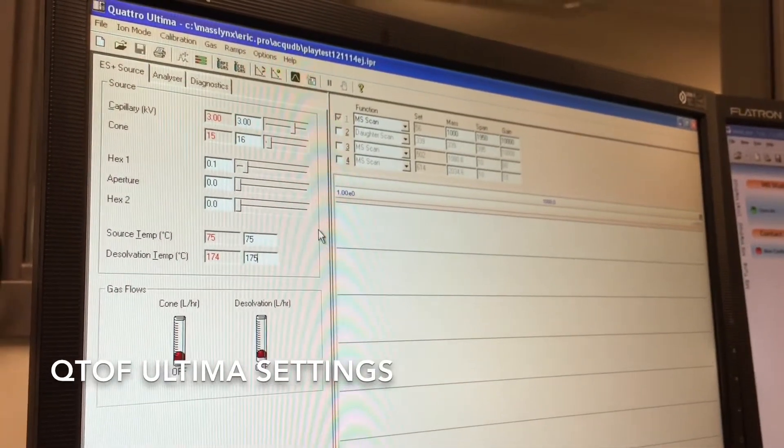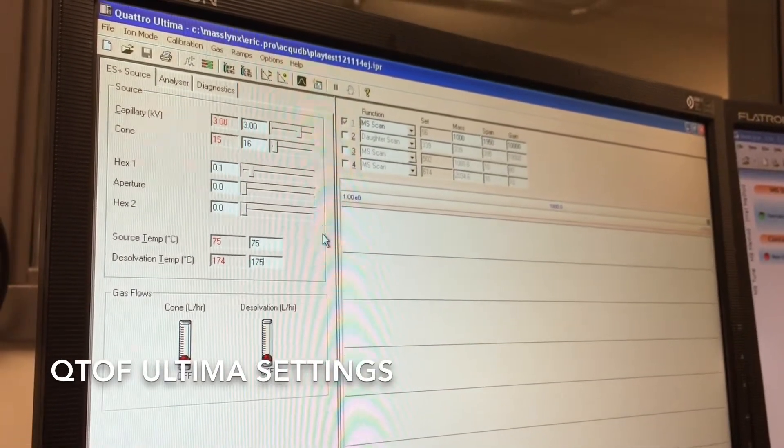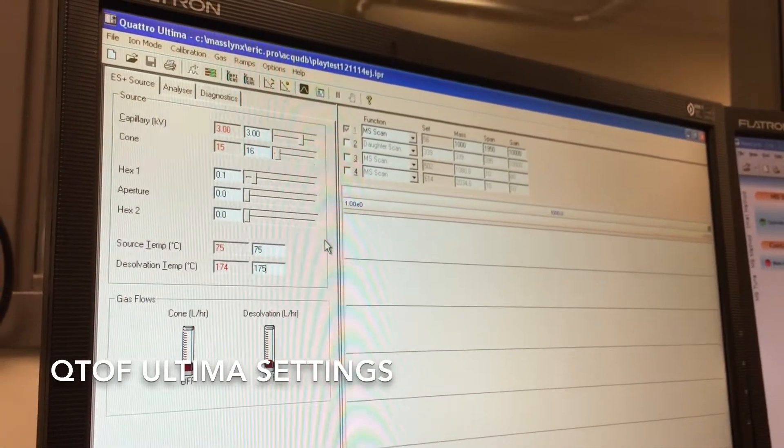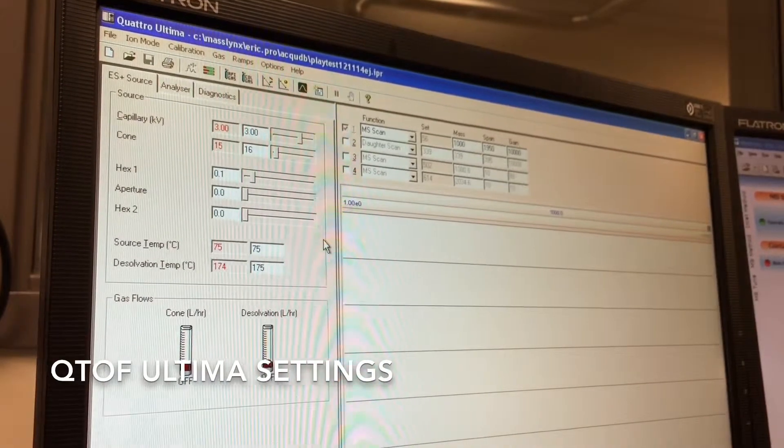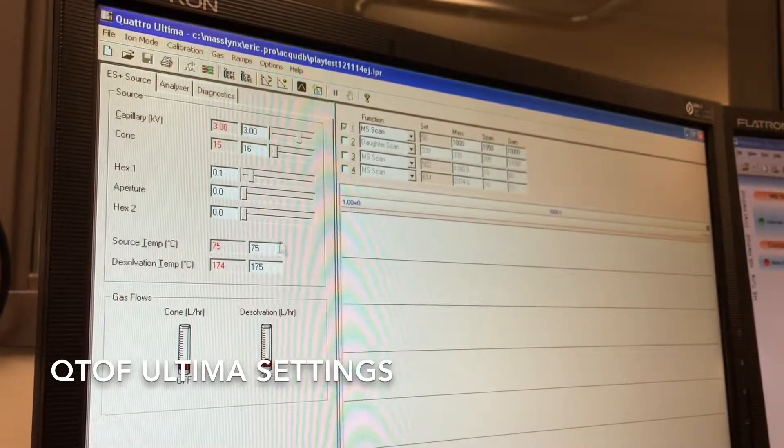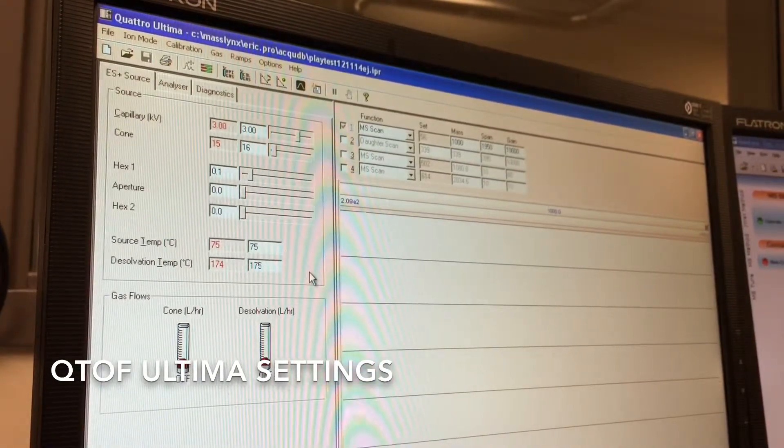Once the instrument is in operate mode, you want to make sure that your voltages are up and ready to go and that your temperatures are set appropriately.